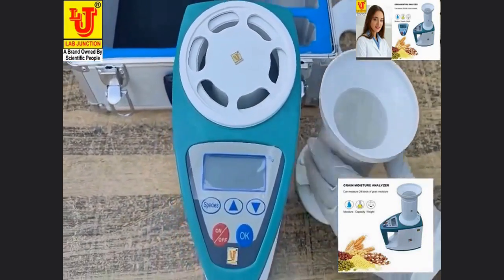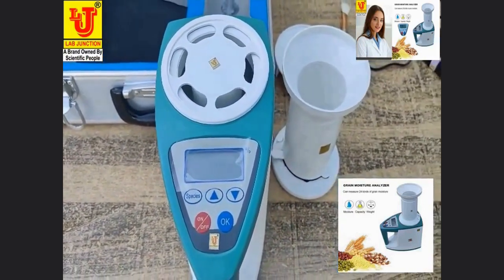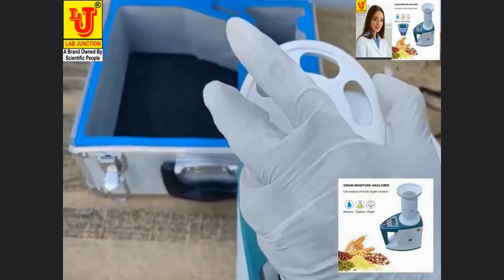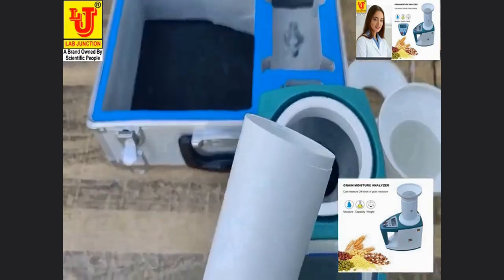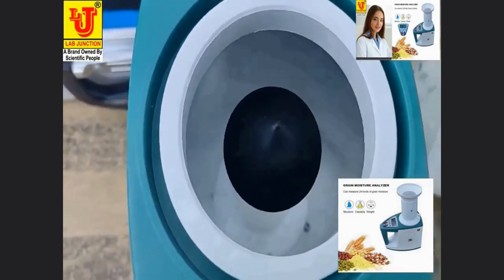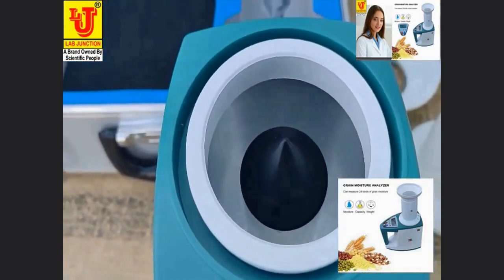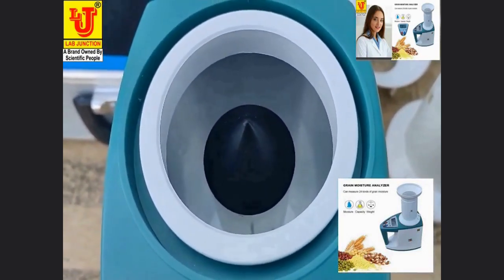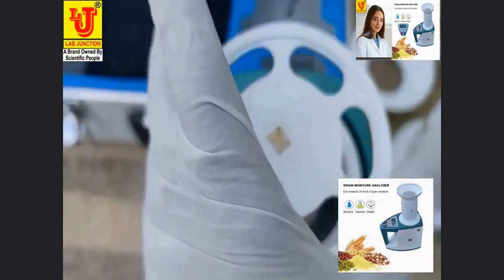This is our main instrument. This is the density sampler or protection cover — protection for this sensor. When you are not using the grain moisture meter, cover this sensor with this protection cover.